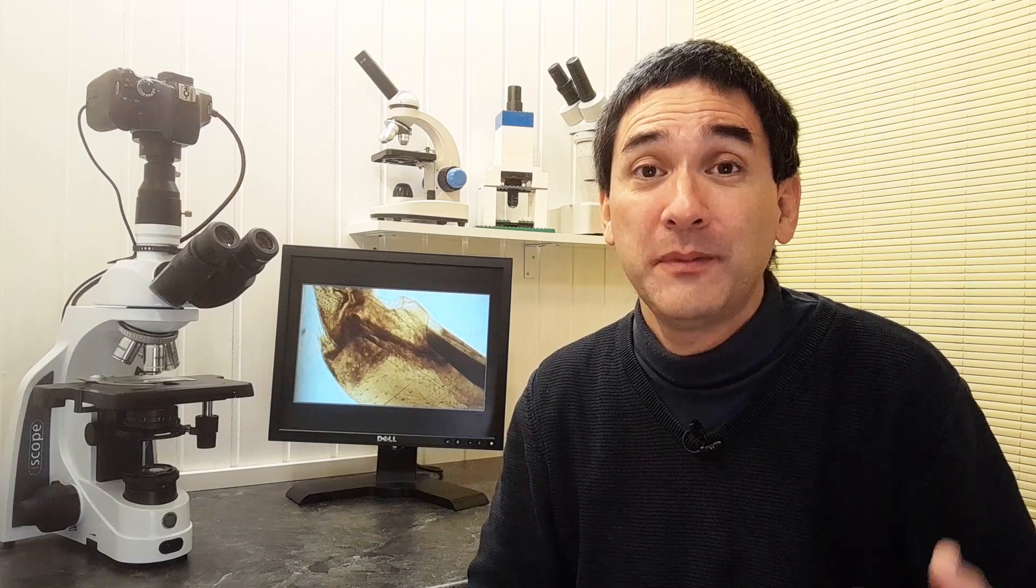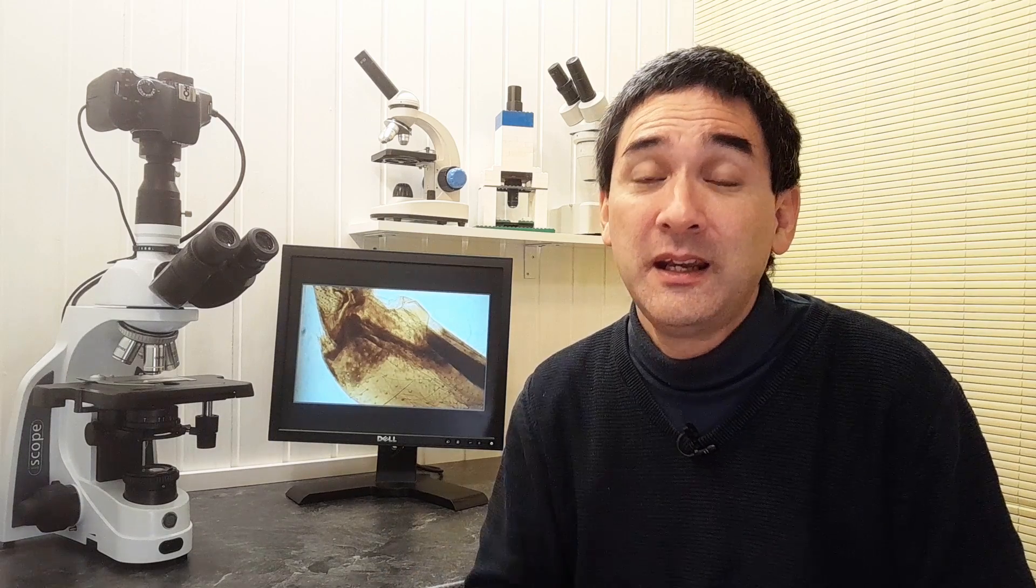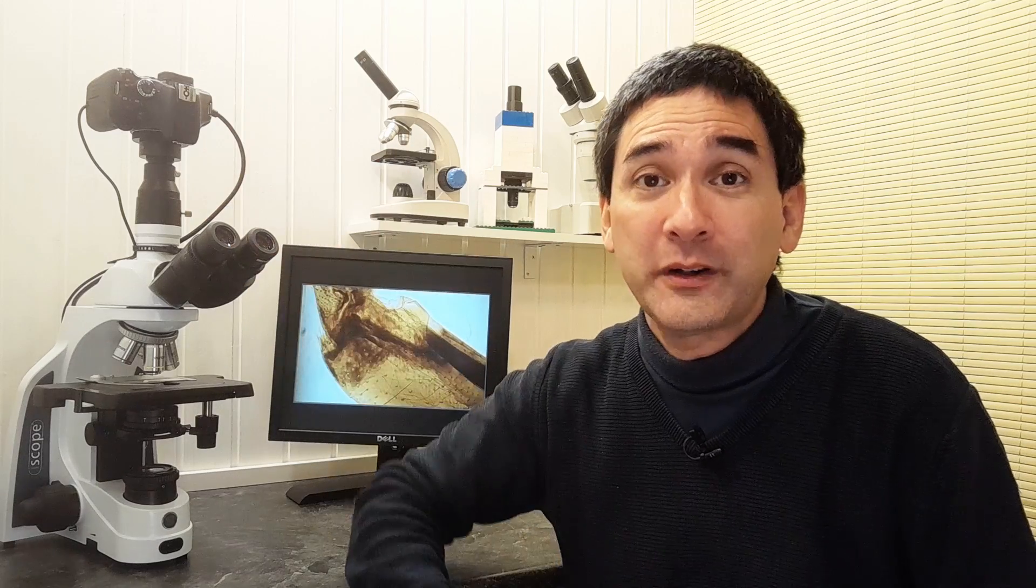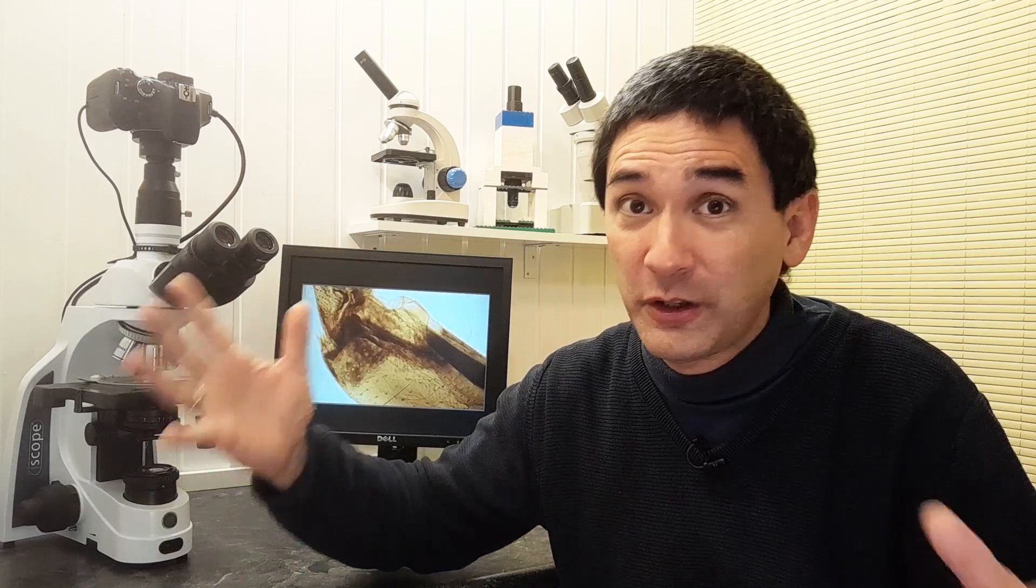And now the question is, if this is the case, why do they still manufacture and sell microscope cameras that have 20 megapixels? And even I have once seen on a website, microscope cameras with 30 megapixels. Now that is a lot. And in the case of my DSLR camera here, that has, I think, also a very large number of megapixels. But generally, I've not bought this camera specifically for the use of a microscope. And the question is now, why is that? Why do they actually make camera sensors with 30 megapixels?